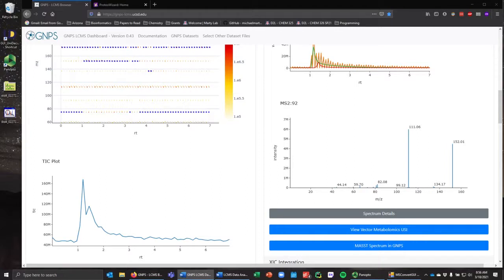I hope this was a useful intro into some of the basic data analysis features that we'll be using here in the teaching labs at UA. There are a lot more features in here that we didn't have time to talk about. It's a very feature-rich software. I'm sure other people are going to post more extensive tutorials explaining other ways you can use this.